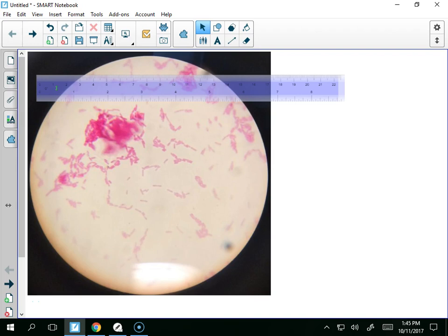Okay, so quick tutorial on how to actually measure and calculate the size of any specimen of anything under any microscope. Yesterday we had a table of our magnifications and the diameters of the field of view. The field of view is that entire circular surface you're seeing under the microscope. But what you're actually looking at changes because you're zooming in more and more, so that area actually gets smaller.